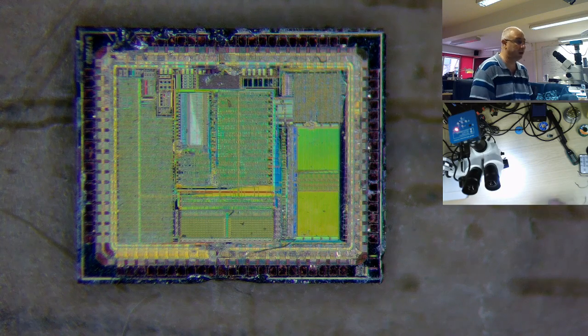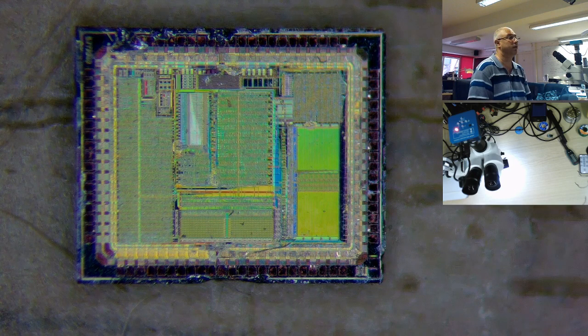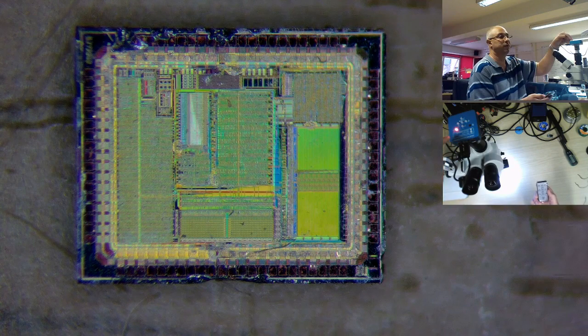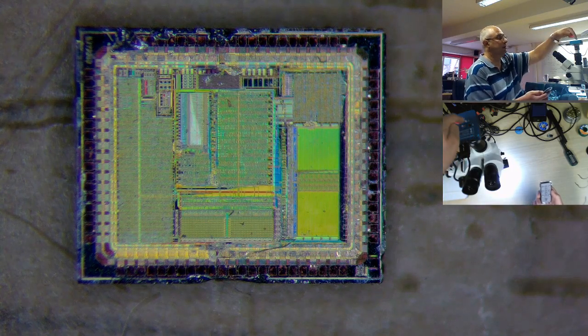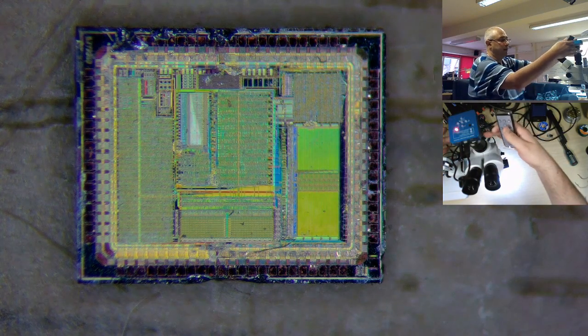It's not really HD on USB — it's not even 30 frames per second. On the remote side, what I noticed is when you press the power button it switches the power off and the red light goes off. But the problem is you cannot press anything to bring it back on again. The only way to switch it back on is to press the power button, and with that force coming down the microscope might move the lens and the whole focus adjustment will have to be redone again — it's a pain in the neck.